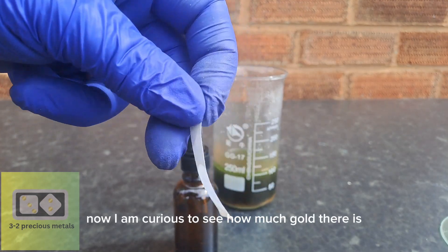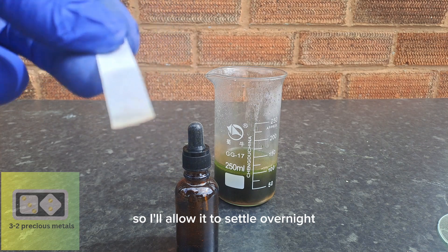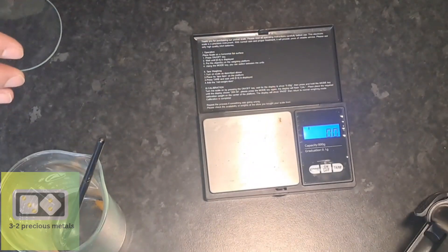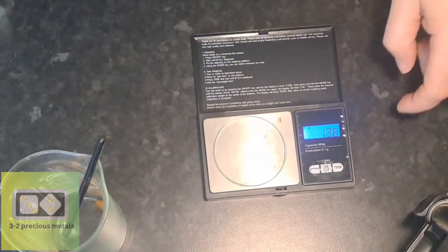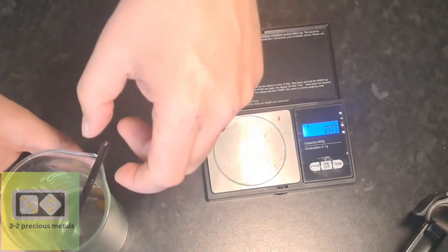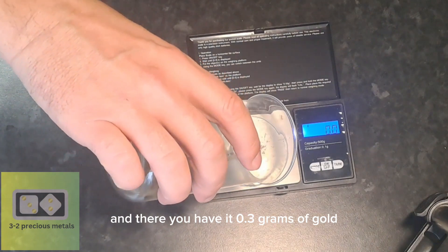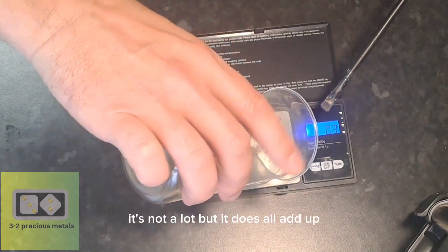Now I am curious to see how much gold there is, so I'll allow it to settle overnight. In the morning, I'll give it a rinse, dry it off, and throw it on a scale. And there you have it — 0.3 grams of gold. It's not a lot, but it does all add up.